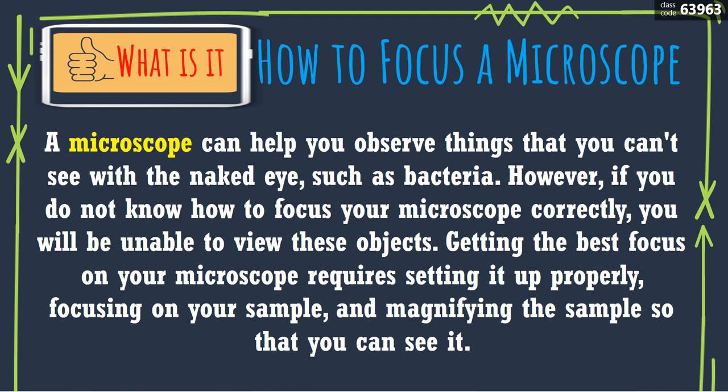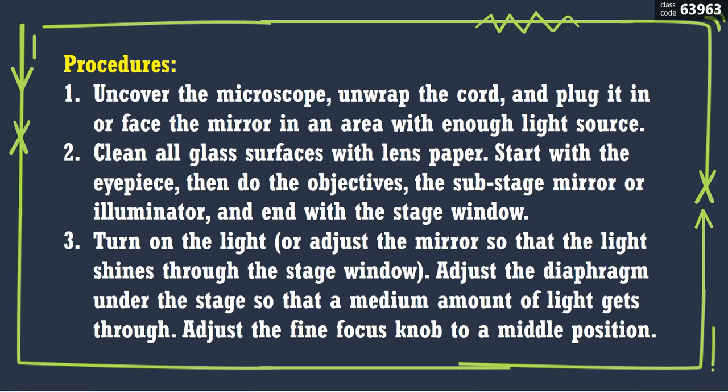How to focus a microscope? A microscope can help you observe things that you can't see with the naked eye, such as bacteria. However, if you do not know how to focus your microscope correctly, you will be unable to view these objects. Getting the best focus on your microscope requires setting up properly, focusing on your sample and magnifying the sample so that you can see it.